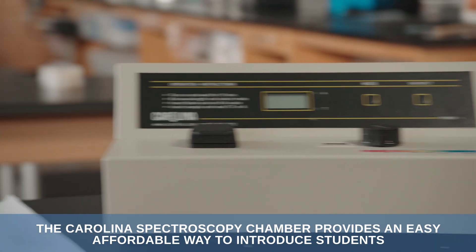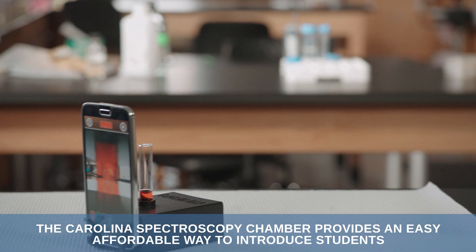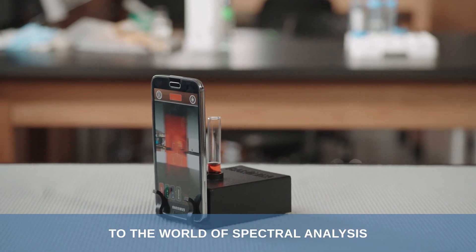The Carolina Spectroscopy Chamber provides an easy, affordable way to introduce students to the world of spectral analysis.